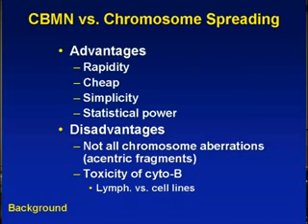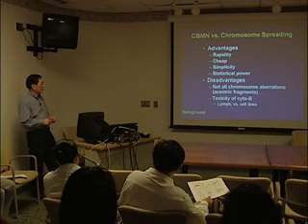And the most troublesome part of this method is that you have to use cytochalasin B, and sometimes it is toxic to the cells. So cytochalasin B itself can induce a certain amount of micronuclei formation. So it depends on the additional treatment, other types of treatment. You might have a very high background, in which you're not able to detect the differences.